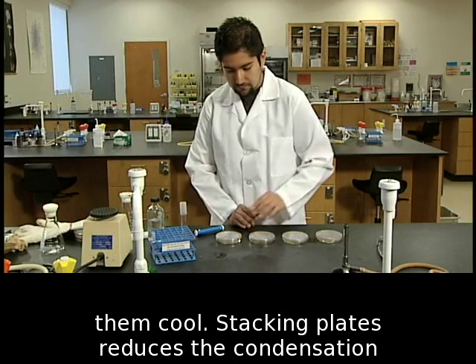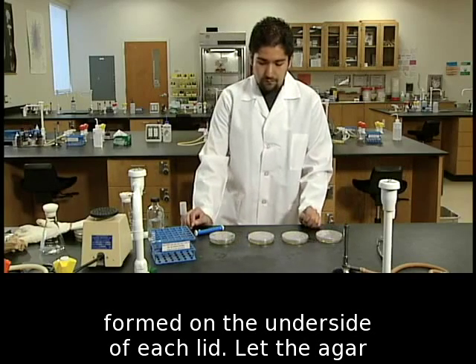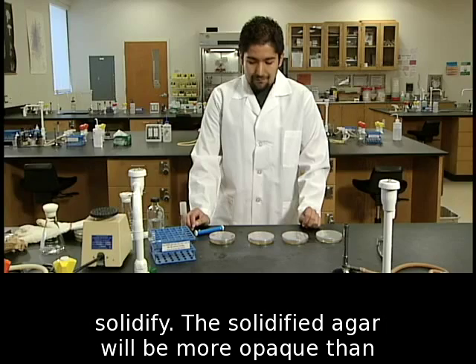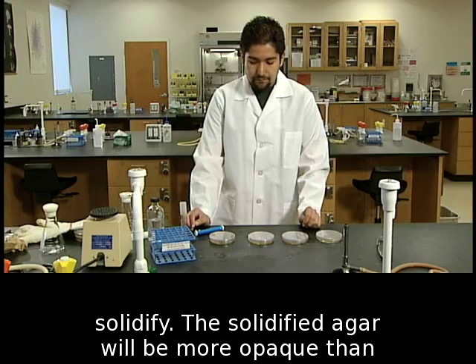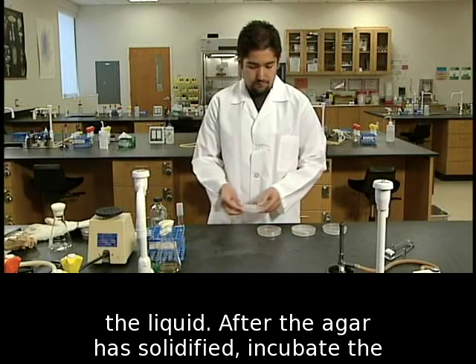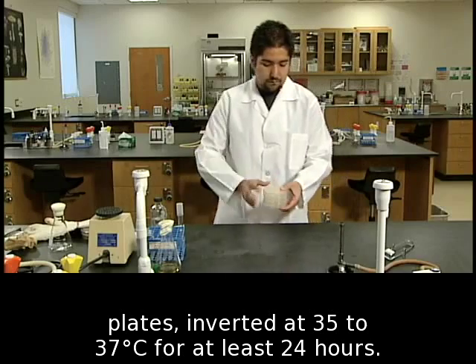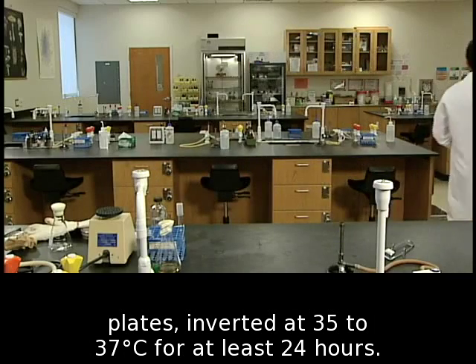Stacking plates reduces the condensation formed on the underside of each lid. Let the agar solidify. The solidified agar will be more opaque than the liquid. After the agar has solidified, incubate the plates, inverted at 35 to 37 degrees Celsius for at least 24 hours.